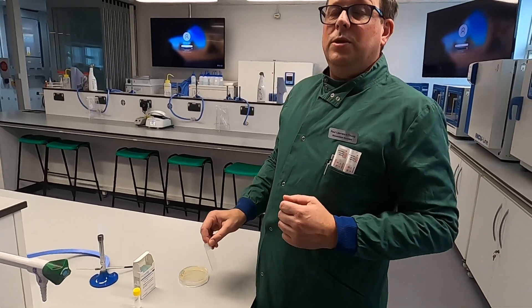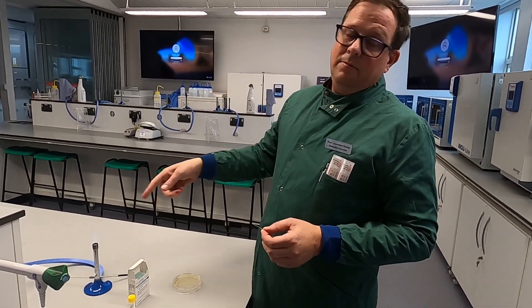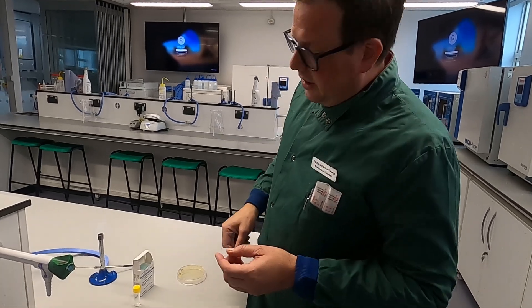Do make sure that when you are doing a gram stain you don't wear gloves, as you're playing with fire and that's sure to be a way to have a bit of trouble.